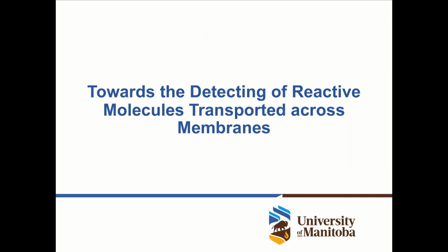Great. So now we have talked about metabolites. We have talked about redox mediators that can be used as indicators for diseases. And now in this last 5 to 7 minutes, I would like to talk about how we can monitor, or aim to monitor, reactive molecules that are transported across membranes.